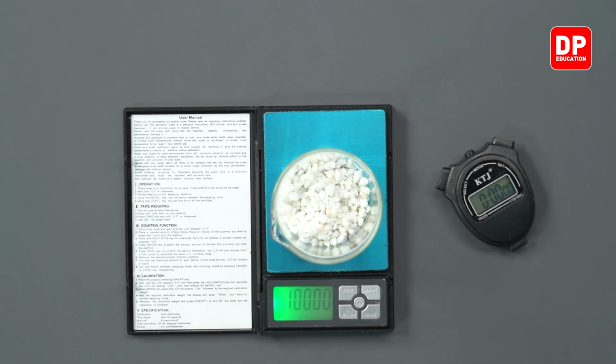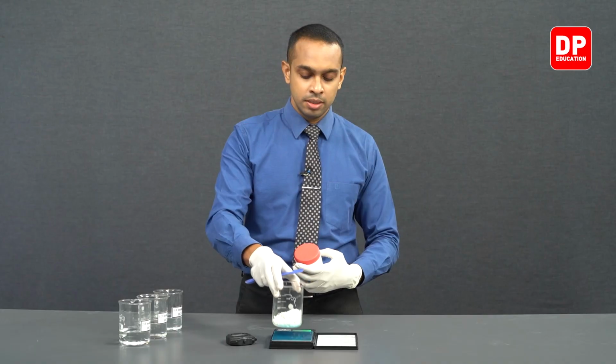Now we have measured exactly 100 grams of calcium carbonate.